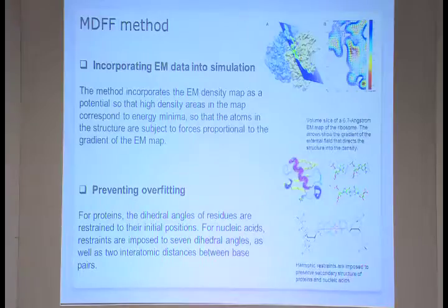So during the dynamic simulation, that's to take care of the overfitting. It shouldn't break this structure, because at this resolution we cannot even understand what it is. Even if there is a bend in the helix at 10 angstrom, you shouldn't go for predicting that.